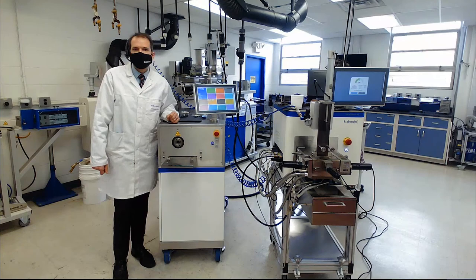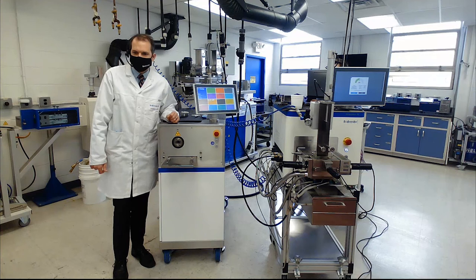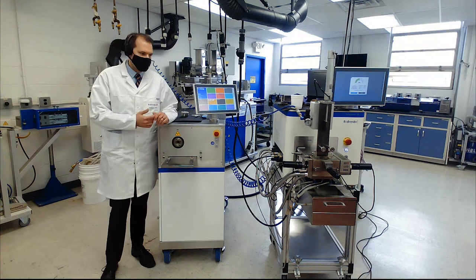Hello everyone, this is Christoph from CW Brabender. Today you're going to see a live demonstration of a rigid PVC test on a mixing measuring head. I wanted to take a quick moment to give you an update about our latest generation of torque rheometers.